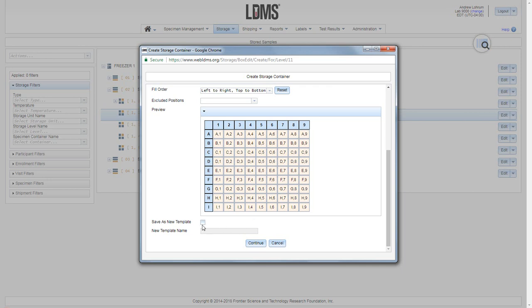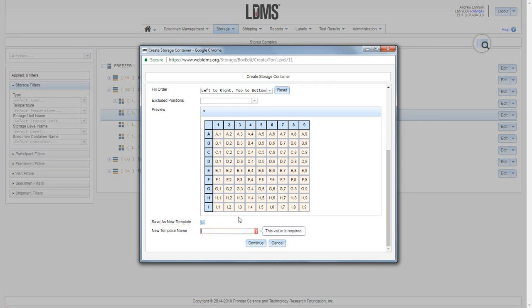Now below that I have an option of creating this as a template by simply checking the save as new template box and giving the template a name.